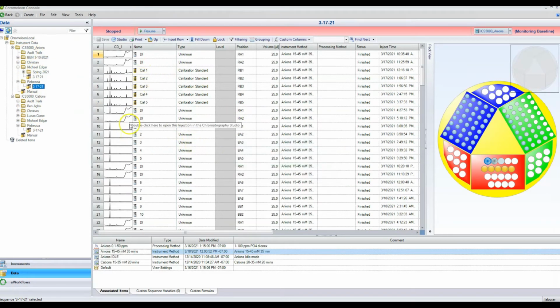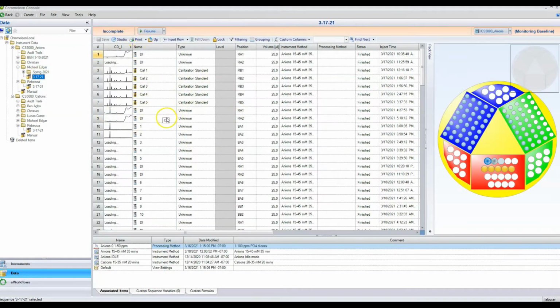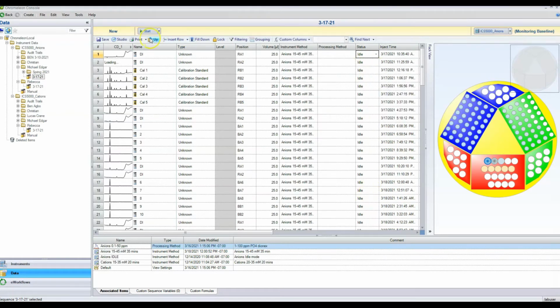So I have pasted their run in here, but now I have all their data too, and I don't want any of their data. So the easiest way to do that is to change this to idle, which basically means, oh, I haven't run, and then fill down. And this fill down button right here is super useful. It basically makes everything underneath it copy whatever I put in that column.